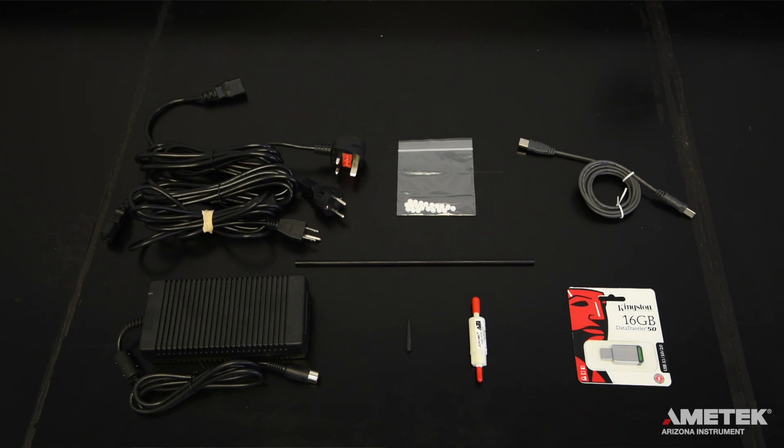Components of the accessory kit for the J605 depend on the instrument model. For all models, you'll receive a three-foot line cord that meets the requirements of the country in which the instrument will be used, an AC power adapter, one pack of 20 fritware filters, a probe, a quarter inch to eighth inch tubing adapter, and a zero air filter.